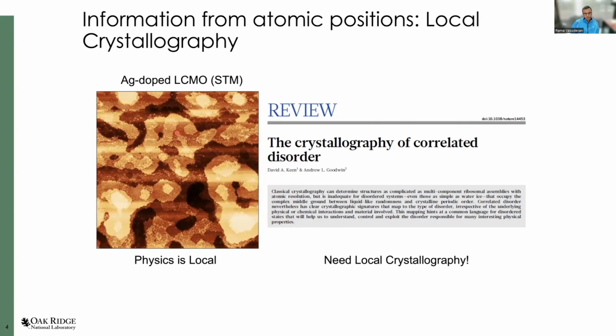So what we are looking at is that if we measure the spectroscopy in these different positions to try to understand electronic properties, then it's really going to depend on the kind of reconstruction that we are in. And so the physics that we're getting here is very local, right? Depending on the surrounding structure, we're going to get slightly different kinds of electronic properties in that particular part of the material.